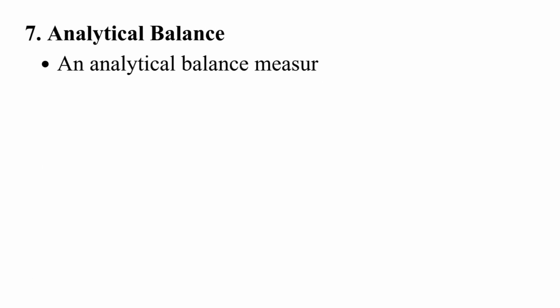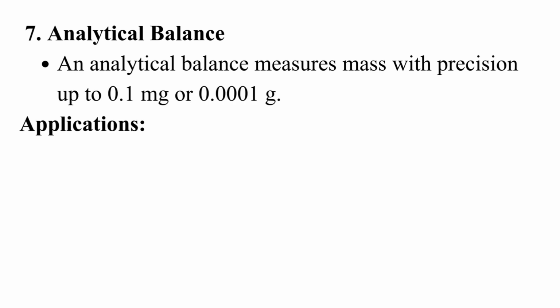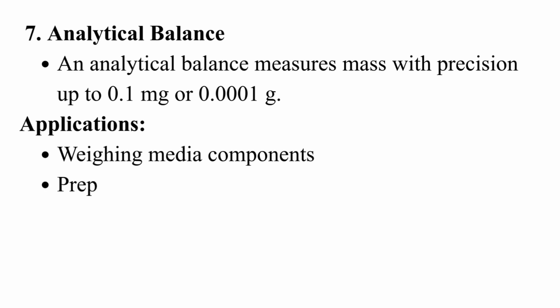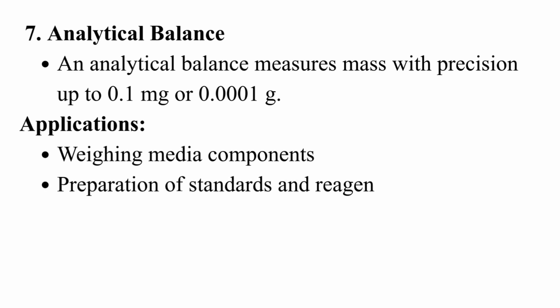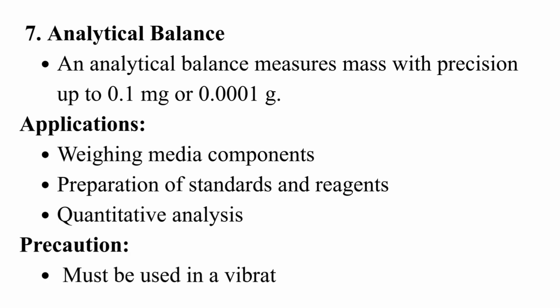Analytical balance. An analytical balance measures mass with precision up to 0.1 mg or 0.0001 g. Applications: weighing media components, preparation of standards and reagents, quantitative analysis. Precaution: must be used in a vibration-free environment.